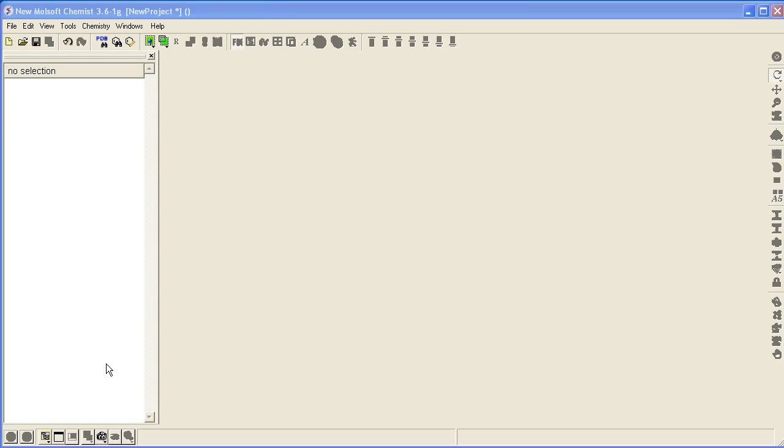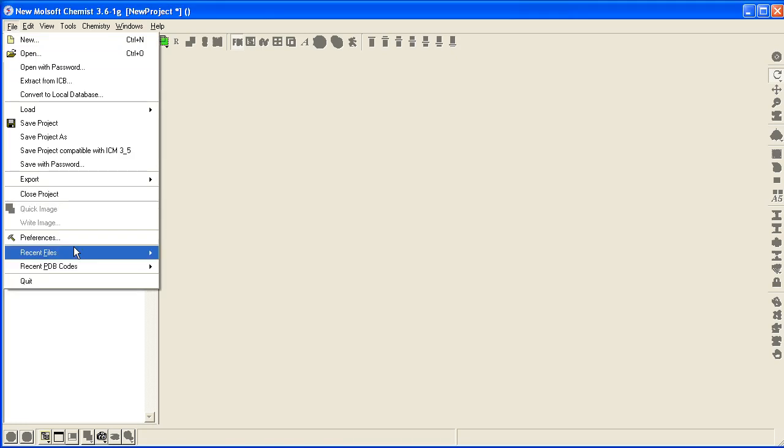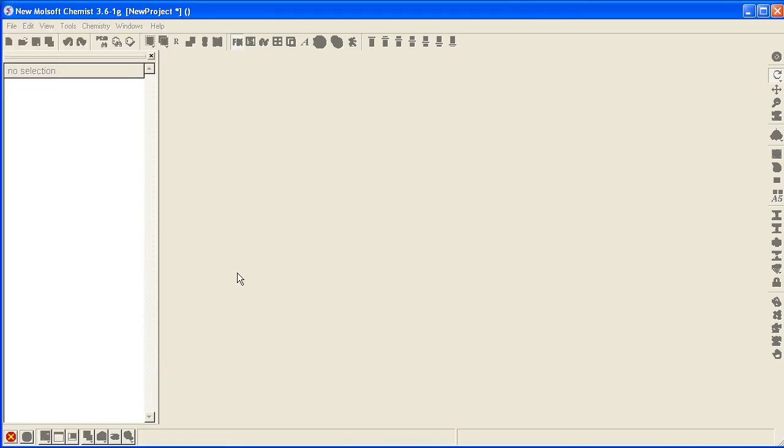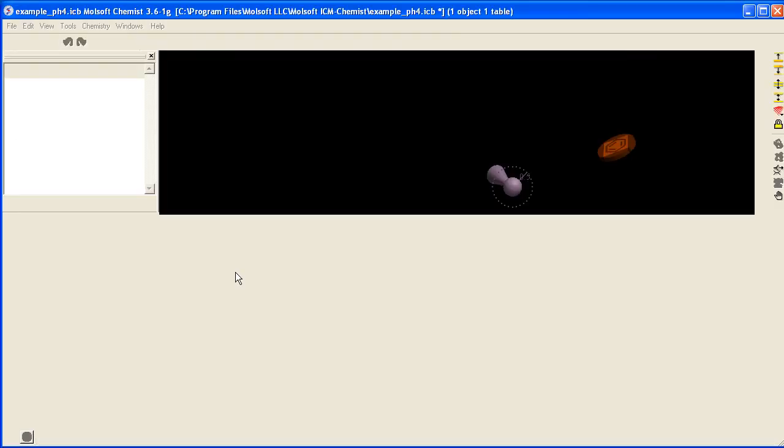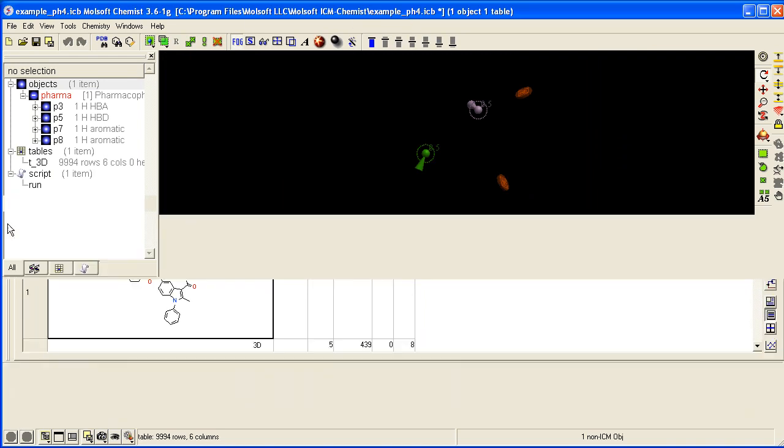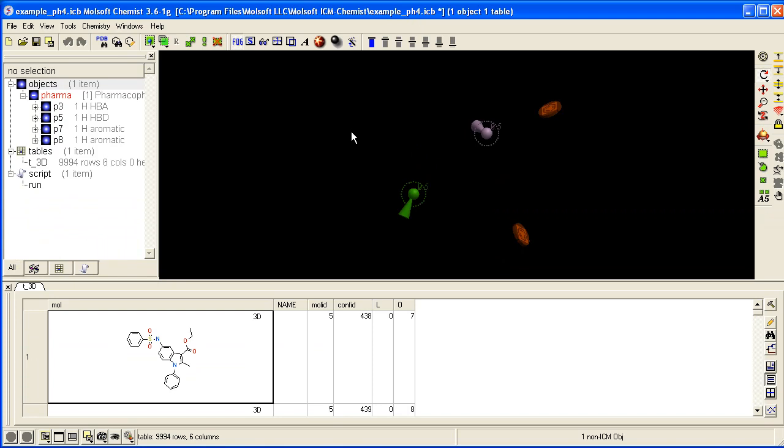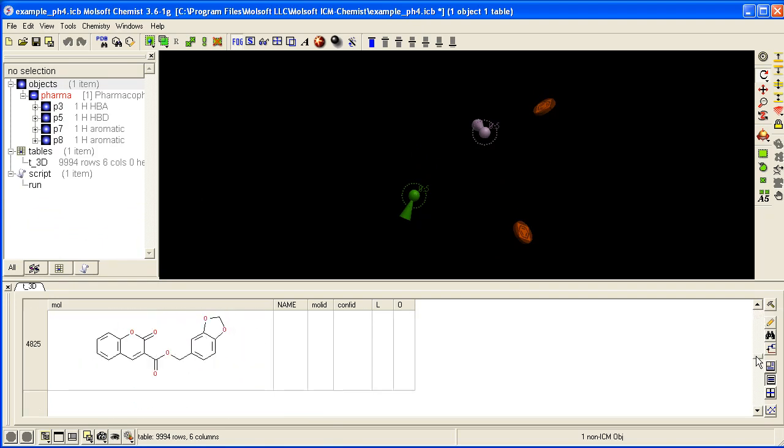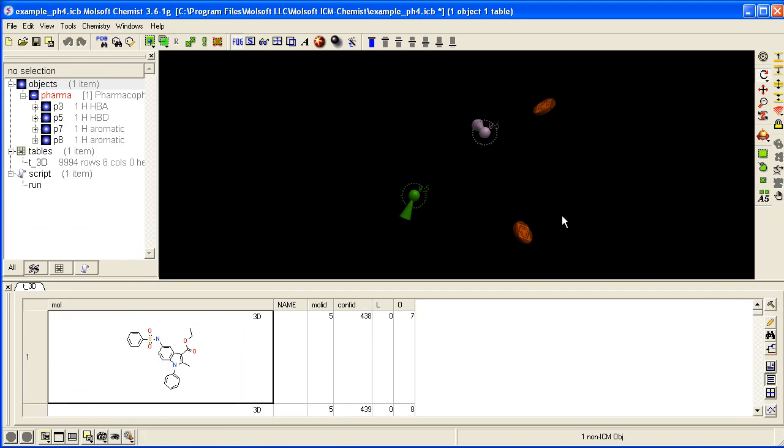How to Edit 3D Pharmacophore Points for 3D Pharmacophore Searching. To begin, go to File and load the example from the ICM distribution called example_PH4. You'll get a selection of 4 Pharmacophore Points and a database with 3D coordinates for 3D searching.